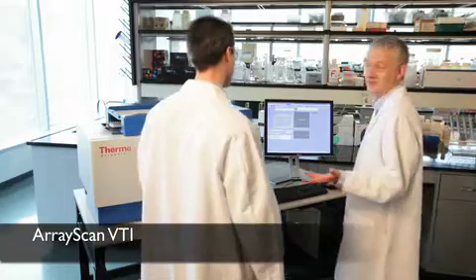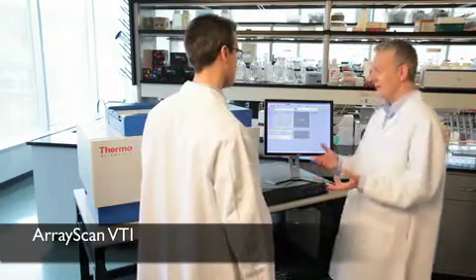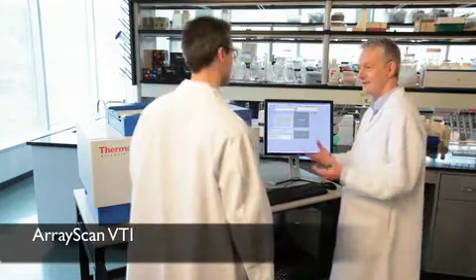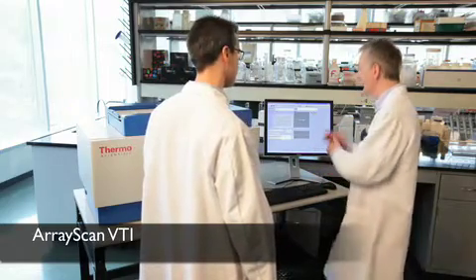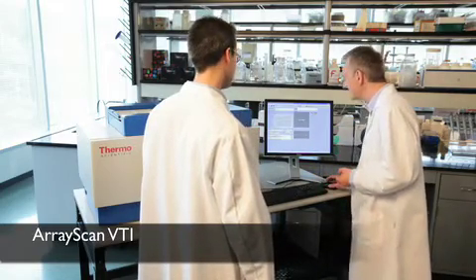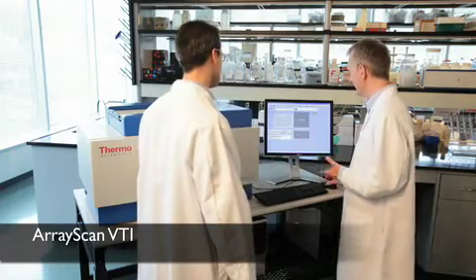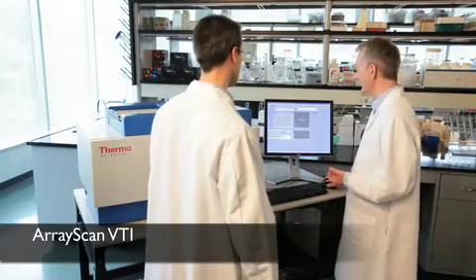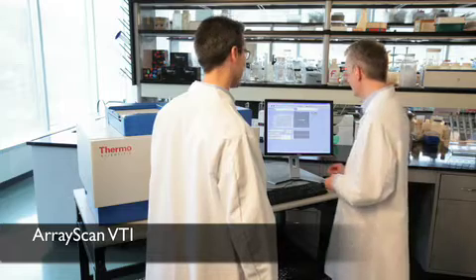And then we have three things to choose. So it's pretty straightforward, right? Yeah. We have to choose a protocol and that protocol tells the instrument how to do the imaging. So how to do the magnification, how to do the different colors for the biology that you have. You have two-channel biology. We have to use a plate type, which tells the system how to image the plate correctly. And we have to use a scan area. And like I said, since I knew you were coming, I set everything up for you so we don't have to do too much.